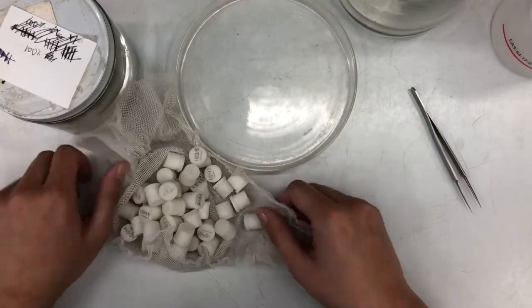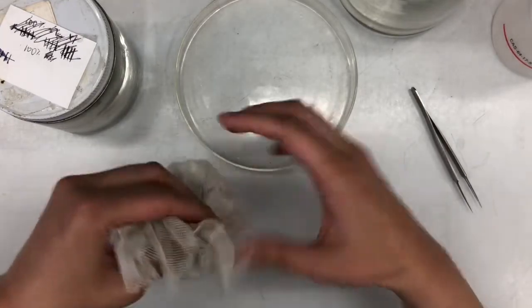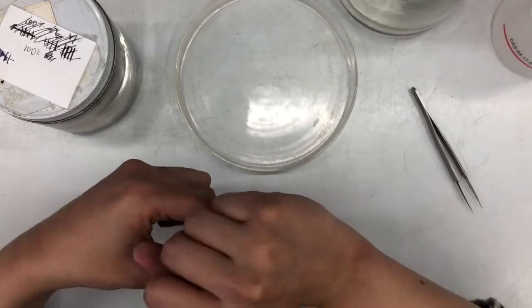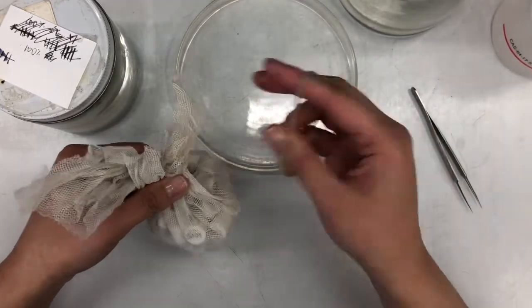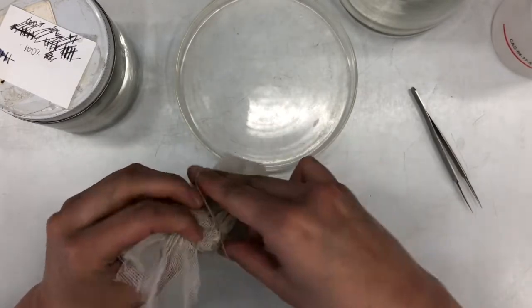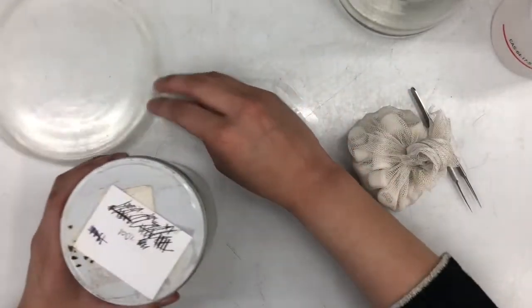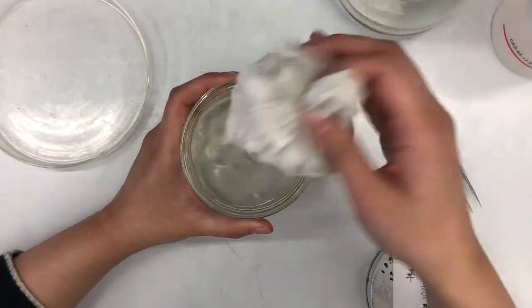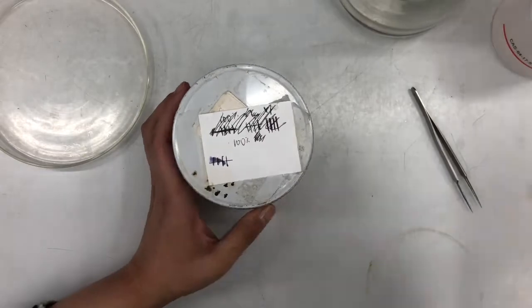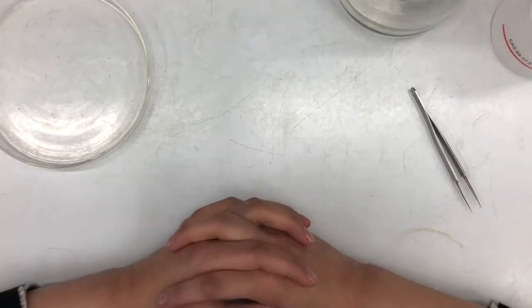Bring up the corners of the netted bag and tie it up. Take one of the thinner elastics and wrap it around - not too tight, so there's a little bit of wiggle room inside the bag, but tight enough that nothing can come out. Put them into the 100% alcohol jar for their second soak. Because they're smaller specimens, they can soak for a minimum of four hours, but I usually just leave them for 24 hours. Then we just wait for the next day to CPD.